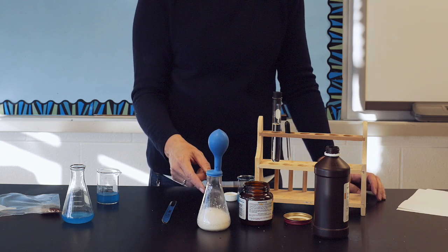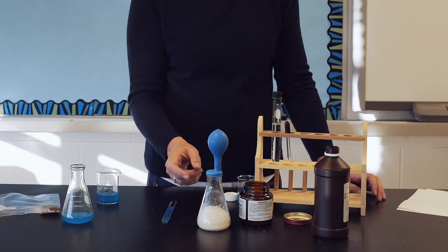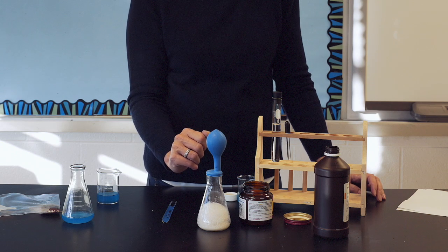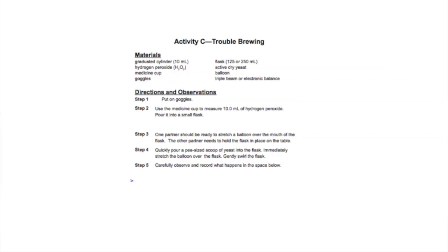You can see bubbles being produced and gas filling the flask and inflating the balloon. Record your observations in the space on sheet four below step five.